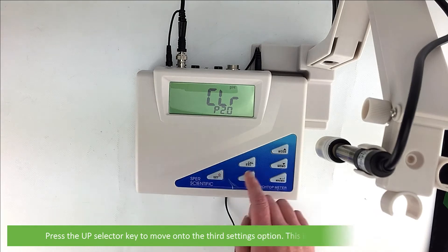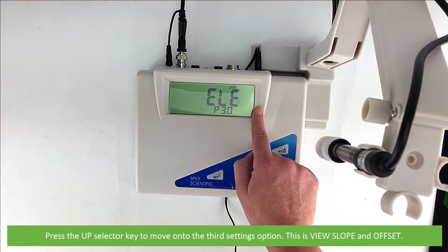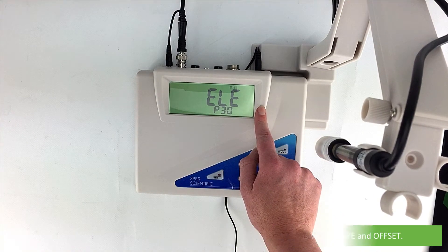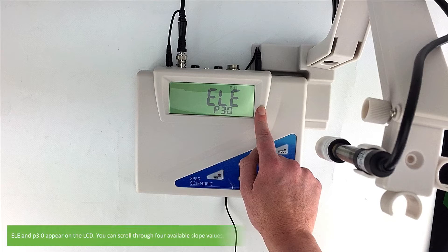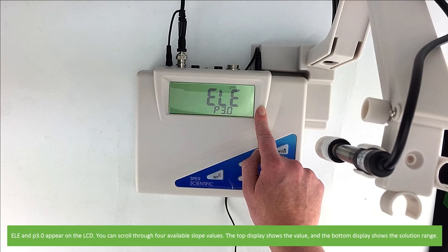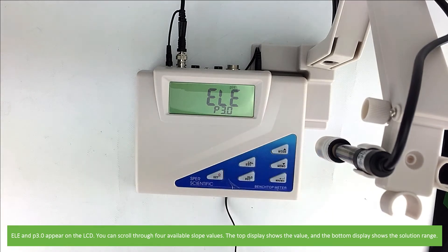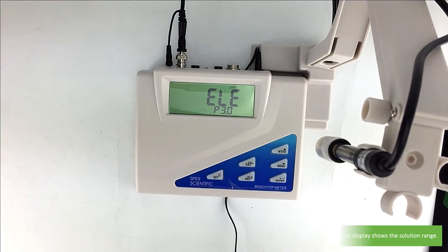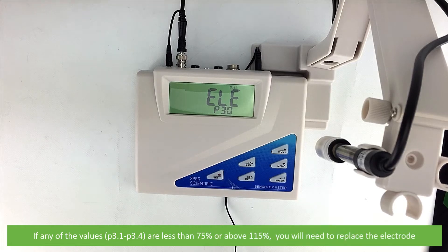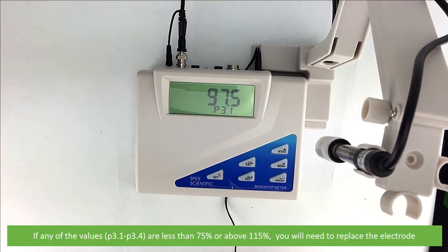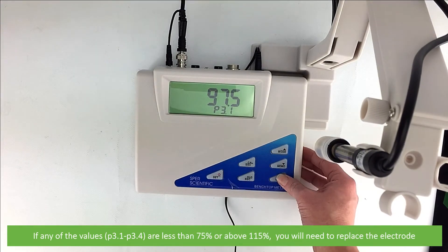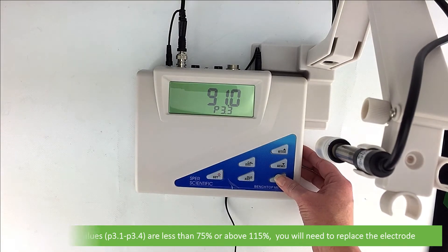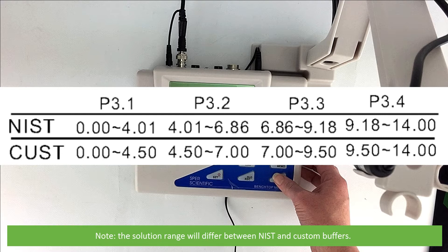Press the up selector key to move on to the third settings option. This is view slope and offset. ELE and P 3.0 appear on the LCD. You can scroll through four available slope values. The top display shows the value and the bottom display shows the solution range. If any of the values for P 3.1 to P 3.4 are less than 75% or above 115% you will need to replace the electrode. Note the solution range will differ between NIST and custom buffers.